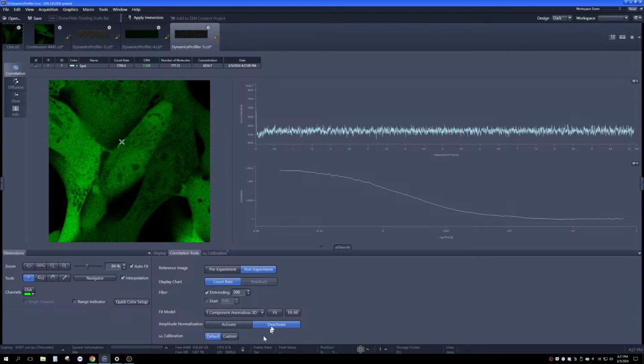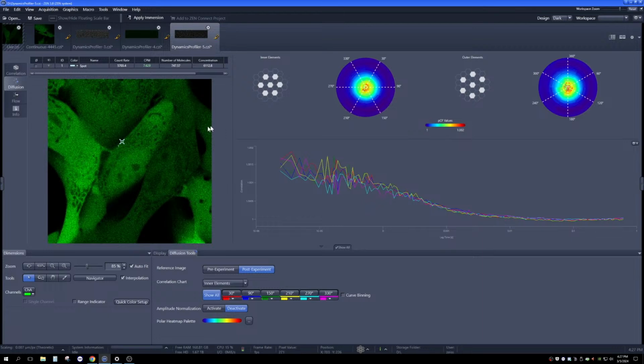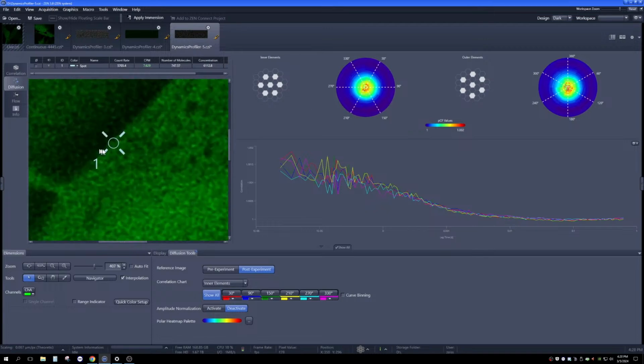And we'll fit our curve. And now we'll see if there's anything going on in these heat maps. Okay, maybe a slight difference on the, I mean, that is exactly where the border is, right, across this 30 to 210. That's basically where we parked our detector.